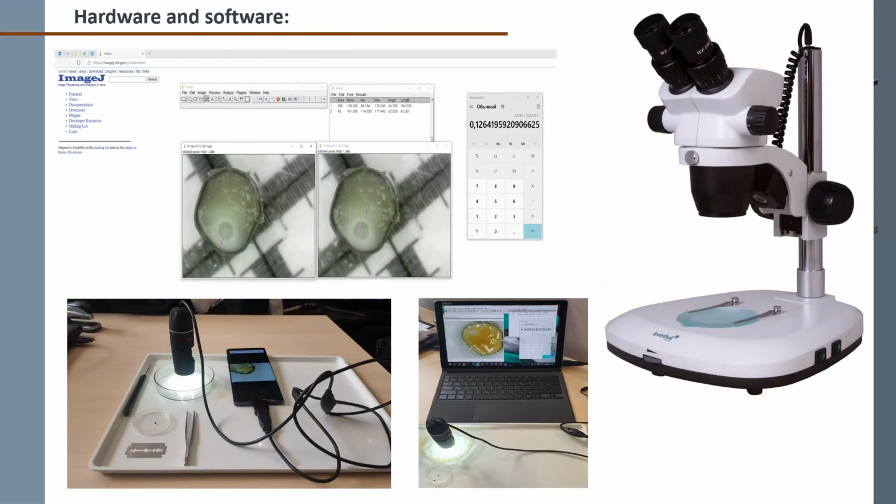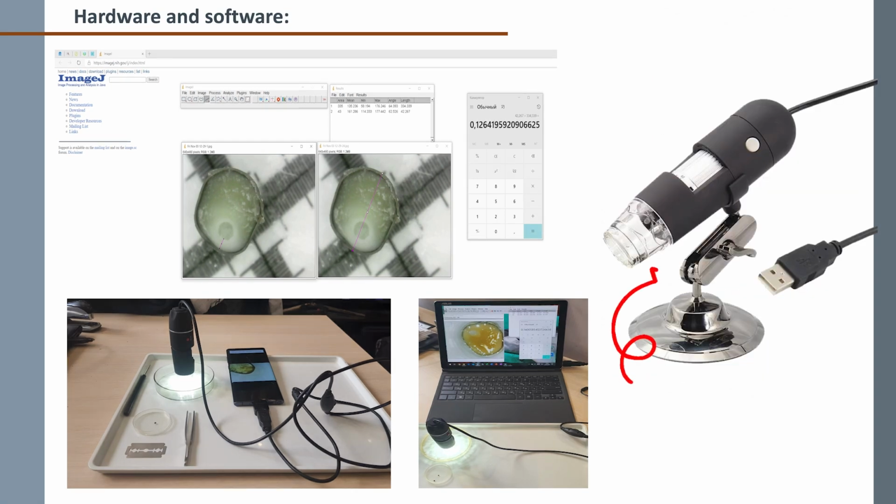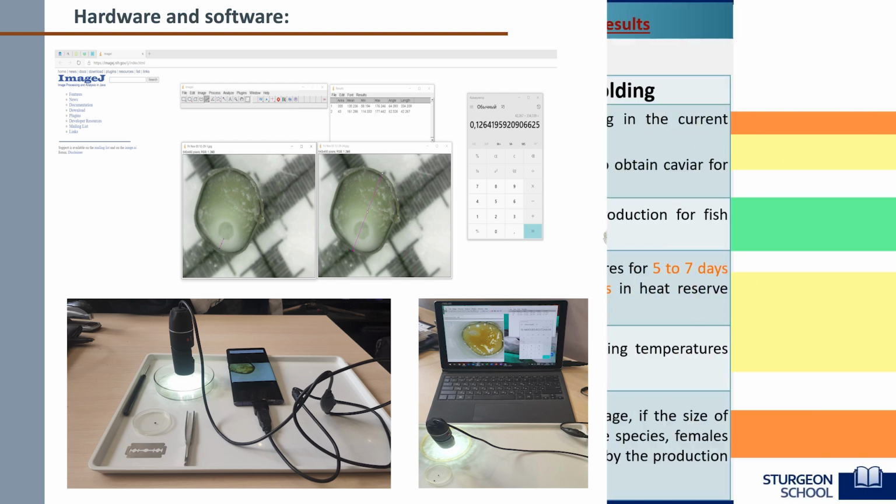To make the necessary measurements, you can use a classic stereo microscope equipped with an ocular micrometer with a measuring ruler, and more affordable technical solutions. For example, compact USB microscopes, the cost of which starts from $10. In this case, to measure distances it is necessary to use some image processing program. We use the program ImageJ, but since a completely simple action is required, any other program will do.